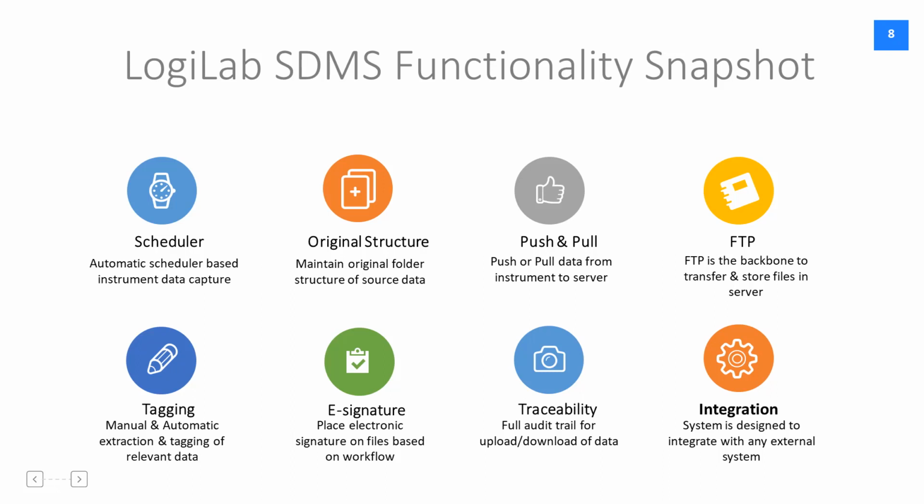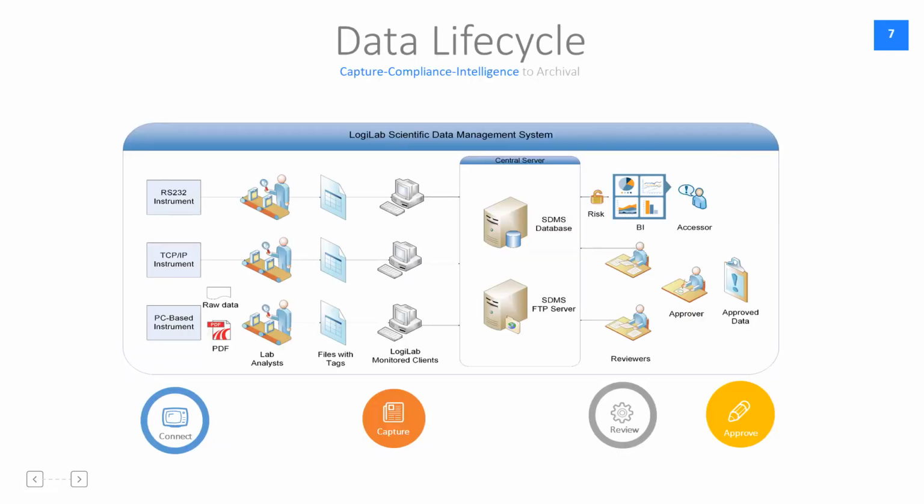It has the appropriate SDKs, APIs and RESTful services available so that external systems can be integrated along with Logilab SDMS. This slide gives you an idea about the data lifecycle inside the Logilab SDMS. Instruments start generating data, and these data are creating files, and these files are being stored in the central repository.